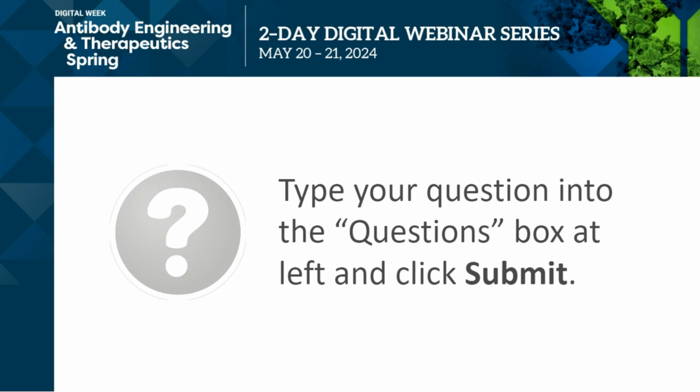Great, thank you. Next question. How did the Gator data help Dr. Xu narrow down the leads? Yeah, so for phage display, we can easily have thousands of binders. From those binders, we need a high throughput screening process for the early screening.